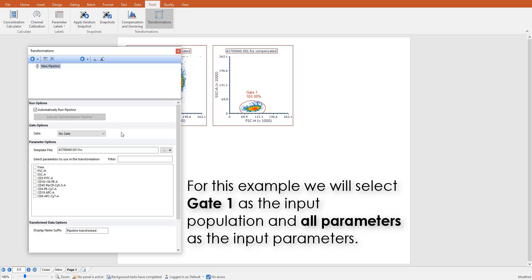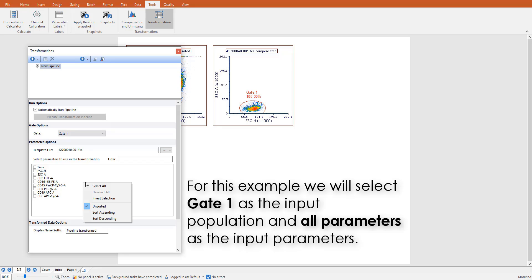For our example, we will select a specific gate as input population, and we will select all parameters via right-click as input parameters.